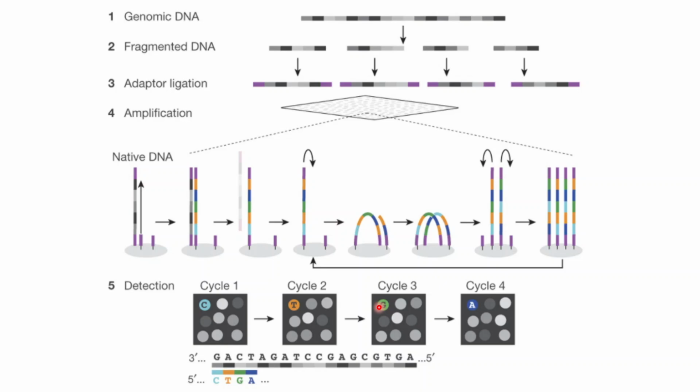So there are two types of assembly. First is the reference genome assembly. If you know the reference, then you can use the reference and align the reads to identify whether there is an SNP or whether this is the genome that we are looking at. Otherwise we have to do a de novo assembly, where if you don't have the reference genome, we do an overlapping between the read ends, and then assemble the whole genome from that. The quality control is good. So that we will all learn in this particular lecture video.